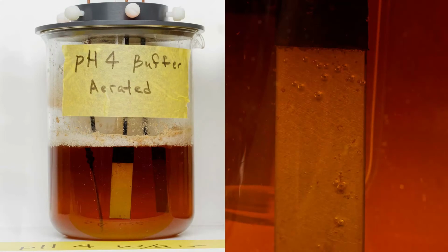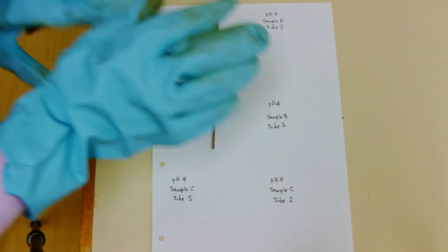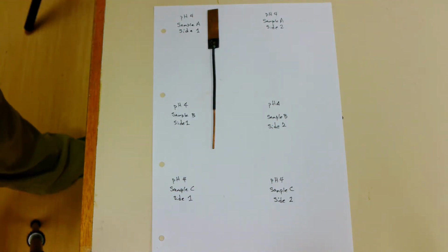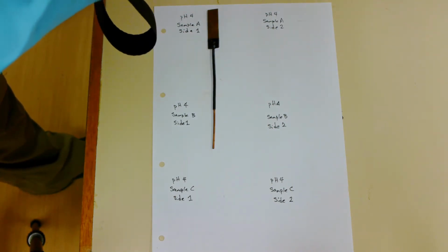This is a photo of the pH 4 buffer cell alongside a close-up of a coupon in the pH 4 cell. These photos were taken 5 days into the experiment when the solution was a little lighter in color and it was still possible to see into the cell. The analysis of coupons in the pH 4 buffer corrosion cell begins with the removal of a single coupon from the cell. The coupon is photographed on both sides.